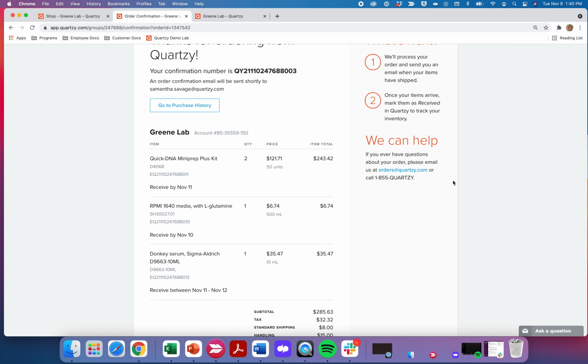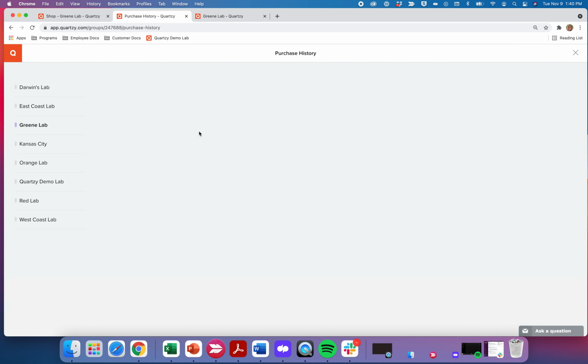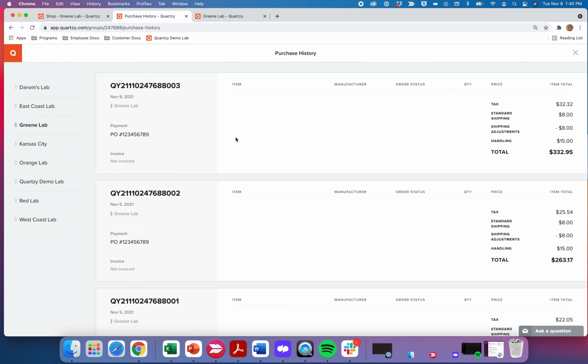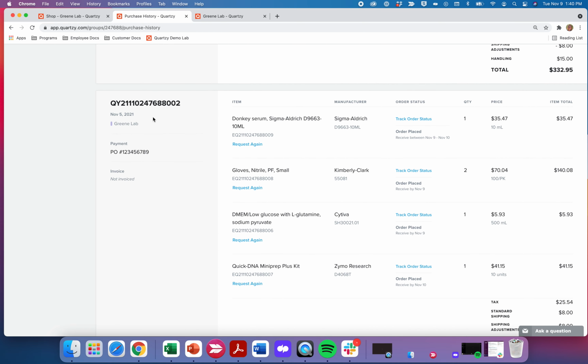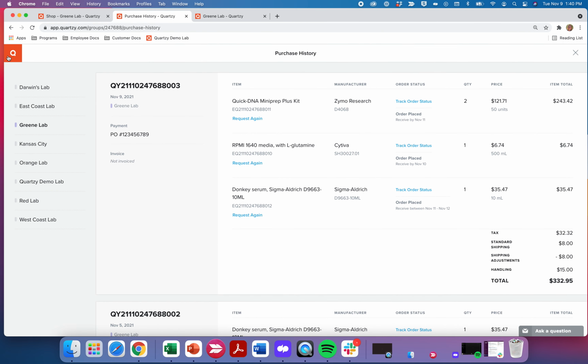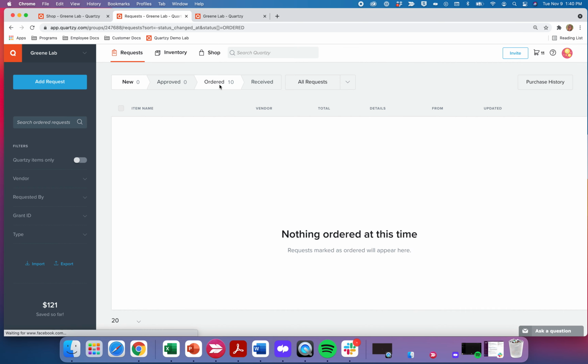If you need to contact us for any reason, you can reach out to orders@quartzy.com, or you can call us at this phone number here, 855-QUARTZY. You can view your full purchase history by going to your purchase history. You can see all of the items that you've purchased from Quartzy with their associated order numbers. You can also navigate back to the home page and view your requests within the ordered tab.